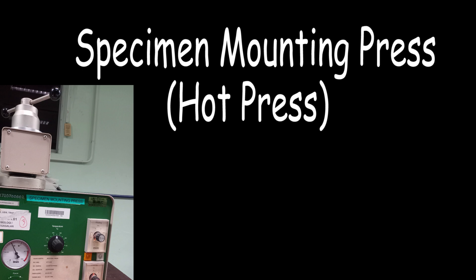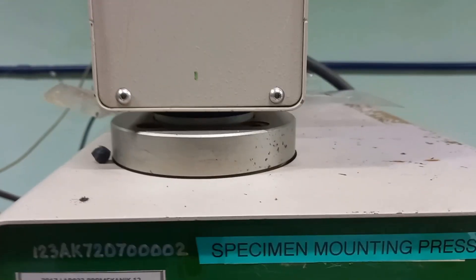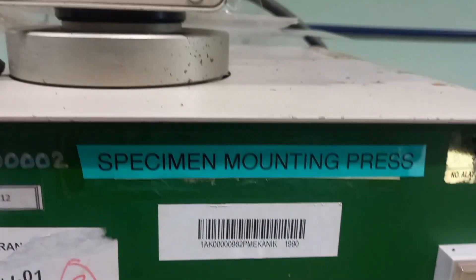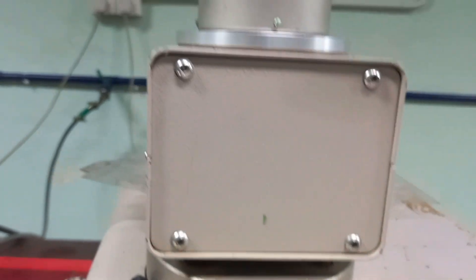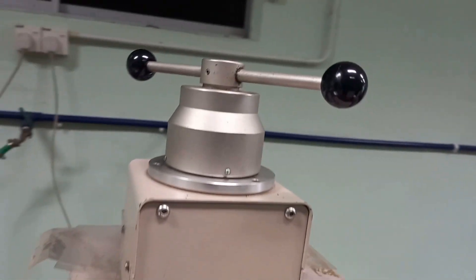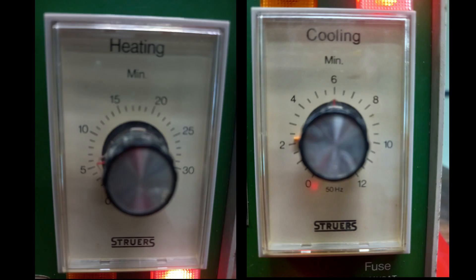The aim of mounting is to handle small or odd-shaped specimens and to protect fragile materials, thin layers or coatings during preparation, as well as to provide good edge retention. Mounting produces specimens with uniform size so that it is easier to handle in automatic holders for further preparation steps. Basically, two methods are available: hot mounting and cold mounting.